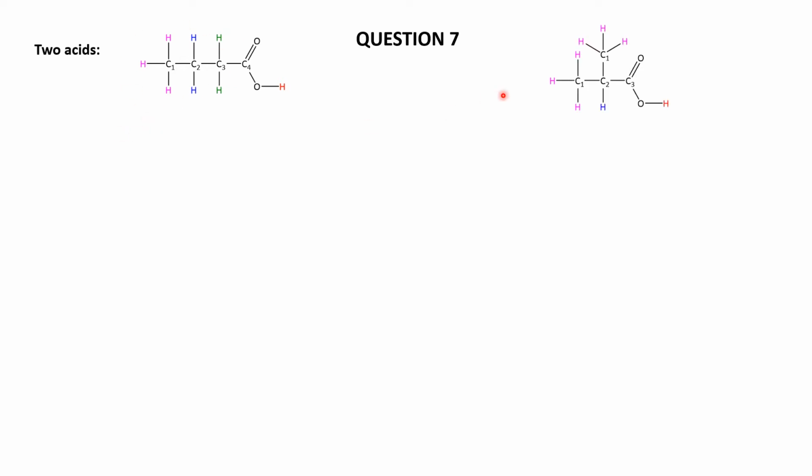First thing I'd do though is I'd start off with the fairly definitive ones, and that is we're told that there are 2 acids. Now there are just 2 acids with that formula. Butanoic acid, so that's the acid group with the 3 remaining carbons. Now if we take the acid group out of the formula, we're left with C3H7. And there's only 2 isomeric forms of C3H7. You can have just the straight propyl, or you can have what I like to call the isopropyl.